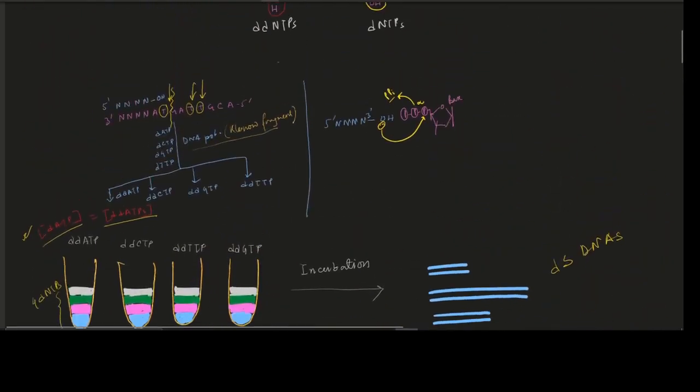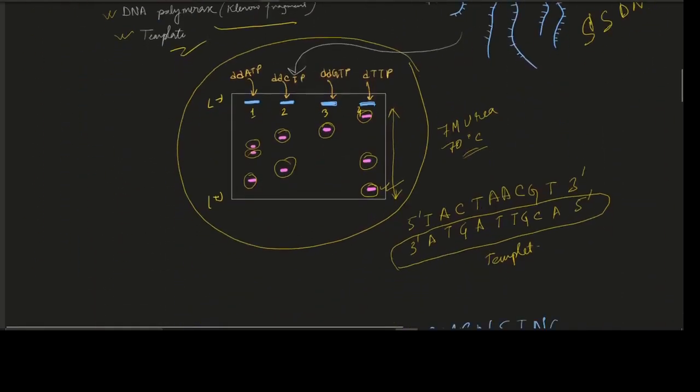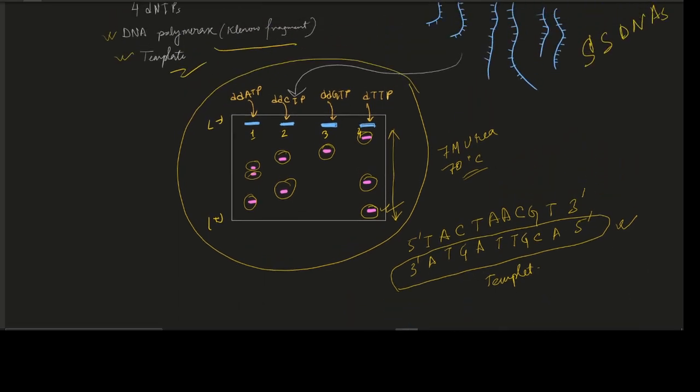Now see, we take this as our template. Now compare these two sequences: they are the same. So for today that's it.